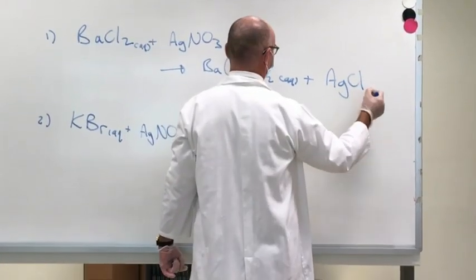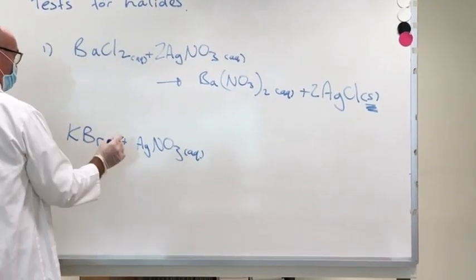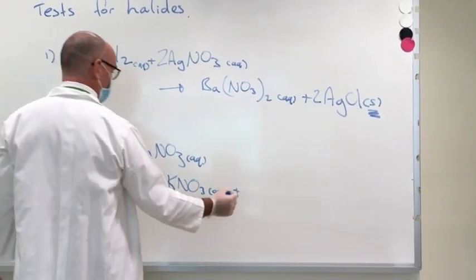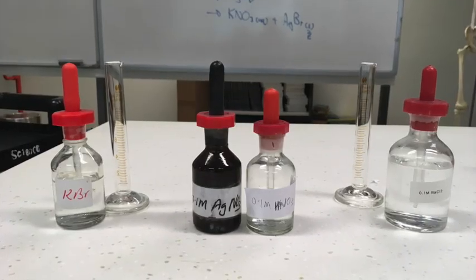You can see the chemistry on the board for those students wanting the high grades, the 9s and the A stars. You should be able to create the balanced chemical equations for these reactions. Certainly there are many questions that just require you to know the colour. Let's have a look at the reactions.